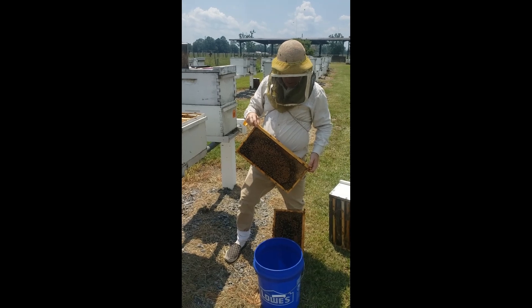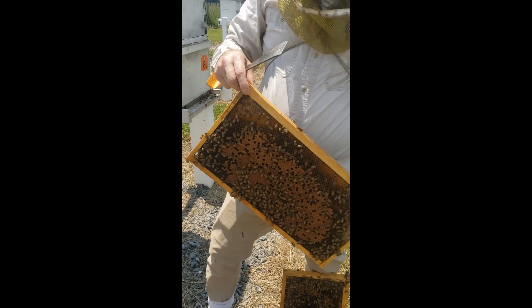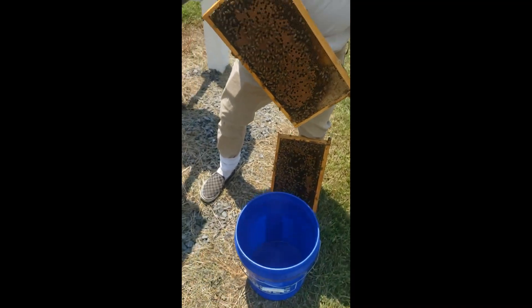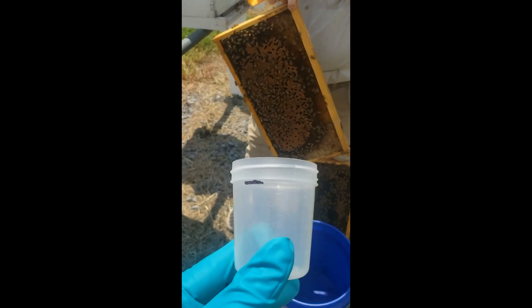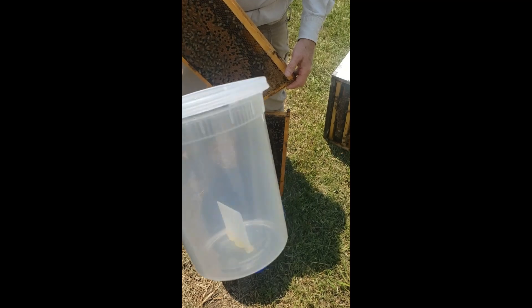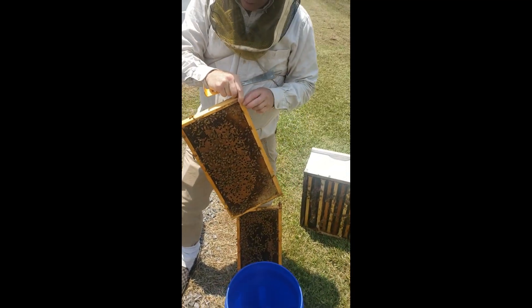We're out in the colony and this is how we're going to collect our sample. Dave has two frames of brood — you can see he has sealed brood covered with bees. He's going to shake them into the bucket. After they go in the bucket, we're going to use this small four-ounce sampling cup to sample the bees. Then they're going to go into that test container with the square vapor bar and the screen lid. Dave's going to shake them into the bucket.